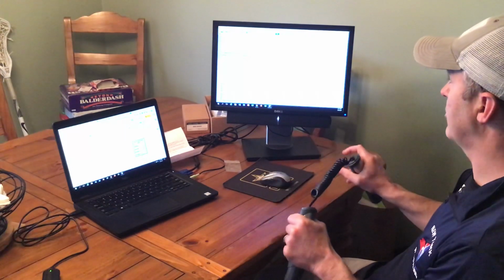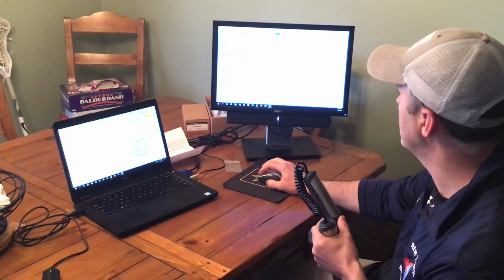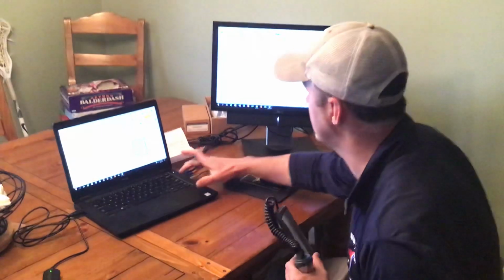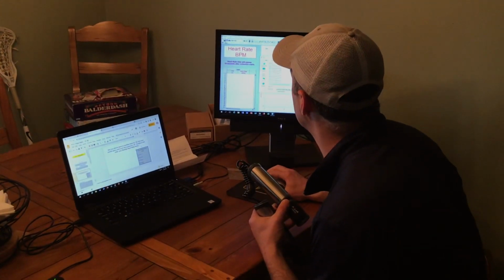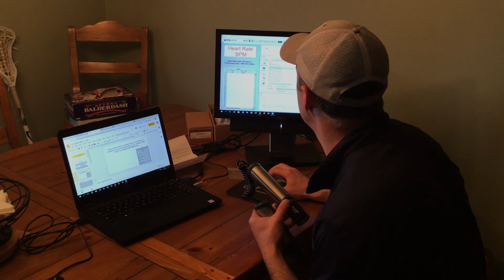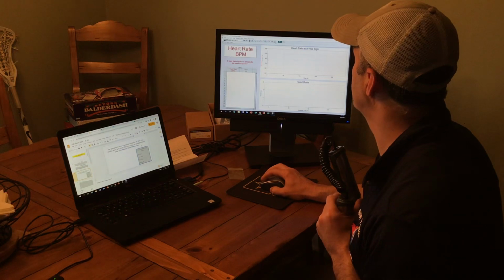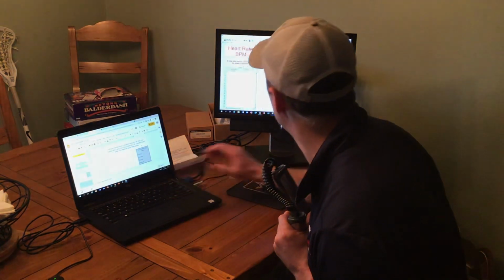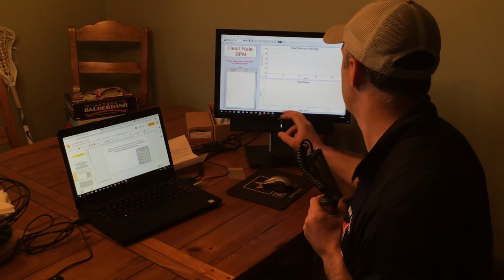Okay, once you've got a firm grasp on that, you make sure you adjust your time. See, it says 600 seconds here. I don't want 600 seconds, I want 60 seconds, and something's not right here. So we're going to go back to heart rate vital sign and make sure we've got the right thing here. Here we go, and boom, it should be 60 seconds. Okay, done, now we're set up.